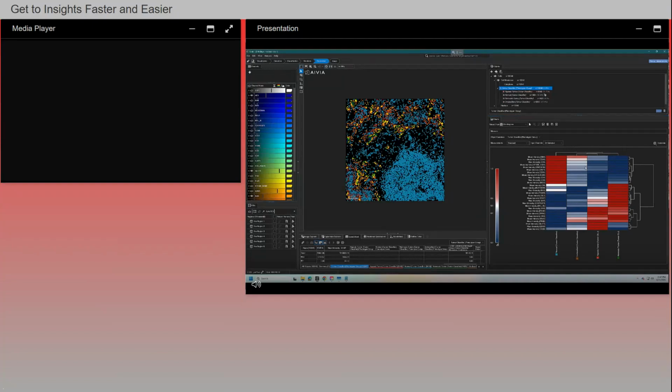Much the same way your family tree will reveal the genetic similarity between you and your siblings versus distant cousins, this dendrogram shows you the similarity between different measurements, as shown in these tree branches, as well as different phenotypes. So for example, you could see the normal cells versus the hypoxic tumor cells have very different intensity distributions for different biological markers.